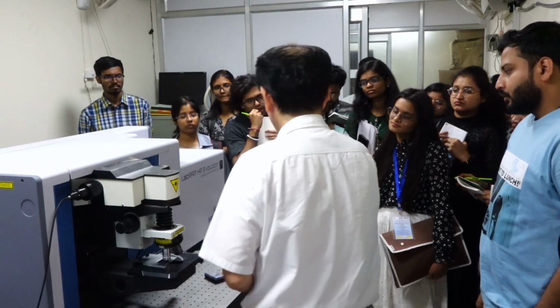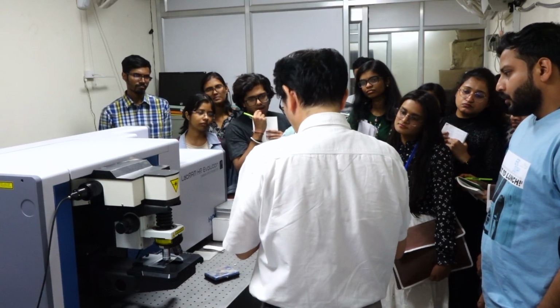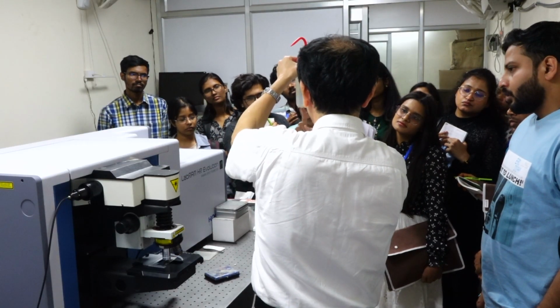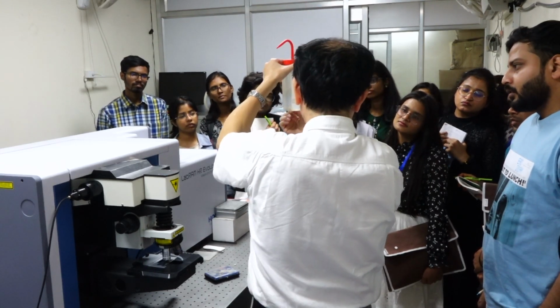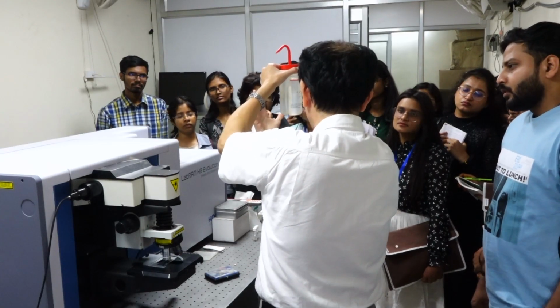Okay. Then in the typical setup, we irradiate a laser beam to the sample cell from the bottom, and the laser beam passes through, and we collect the Raman scattering at 90 degrees at the side.